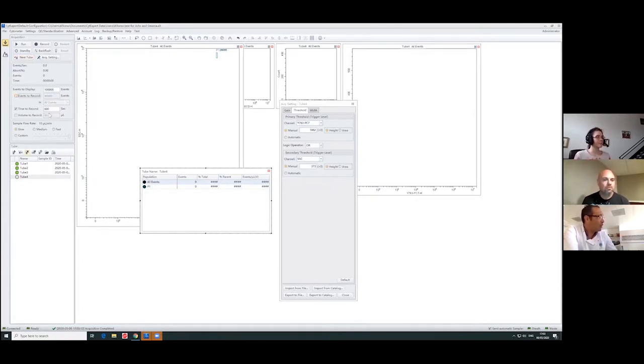What I care is, I want to analyze this for 60 seconds, on a time basis, or I don't care about the volume, but you might be really low on the volume, so you don't want to suck air, because air is coming again. If you have one sample with no control on the volume, and you're talking to your friend, suddenly you run out of the sample, air is coming in, and you have to degas the instrument as well. Get ready for that.